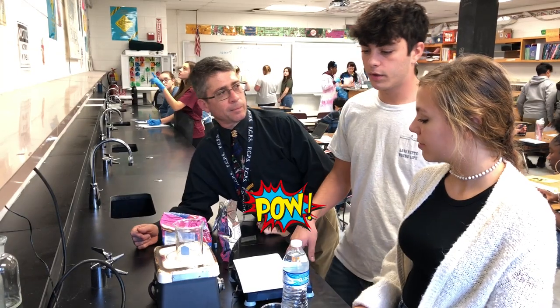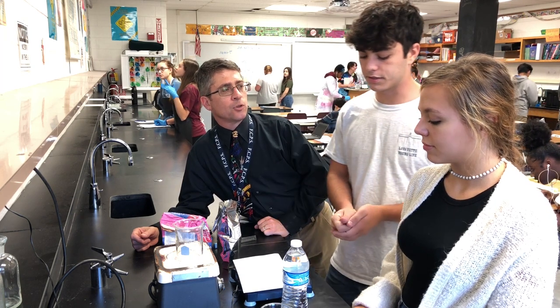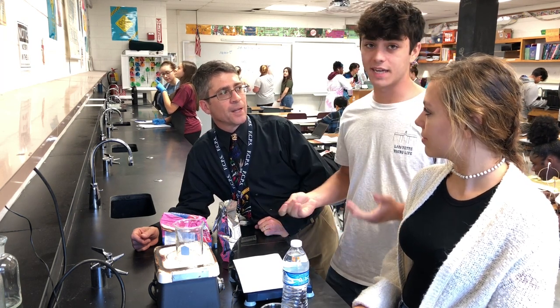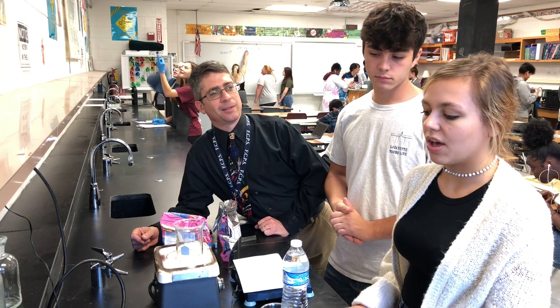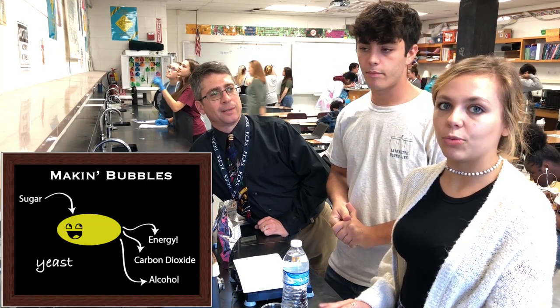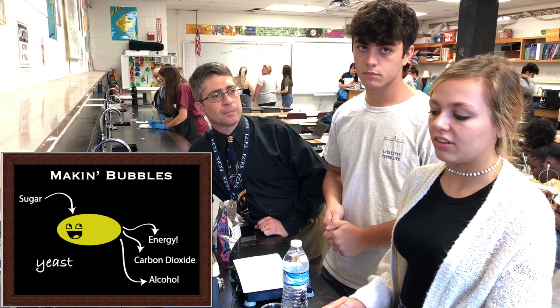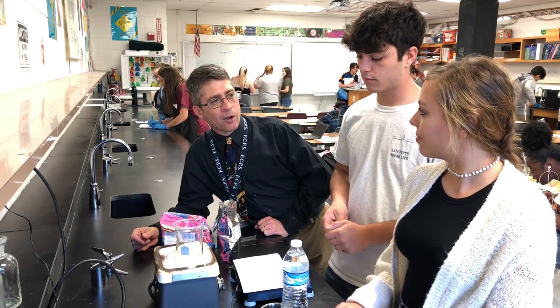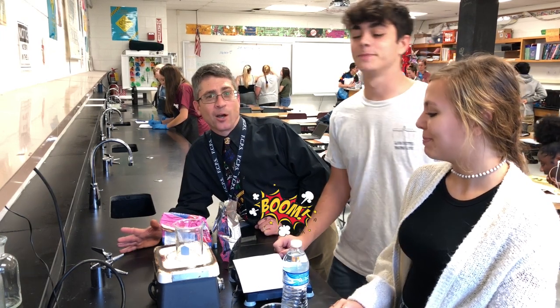What are we doing? We are basically making root beer using fermentation. What does the fermentation do in this lab? Fermentation takes the yeast, which eats the sugar, and that produces alcohol and CO2. So we're making an actual alcoholic beverage? Please tell me no. No. Okay, we are not making an alcoholic beverage, folks.